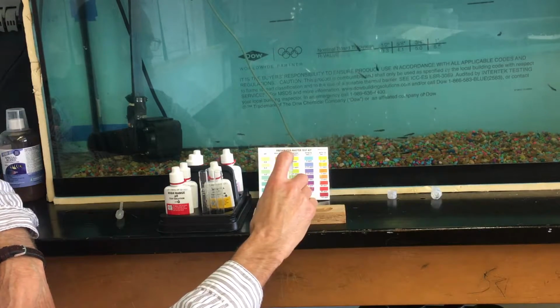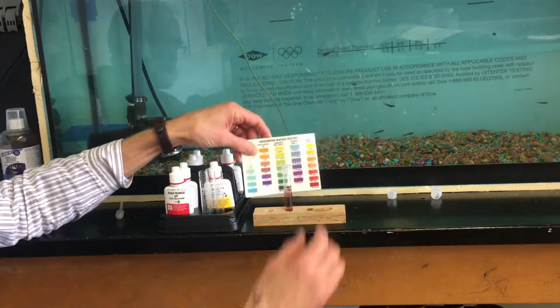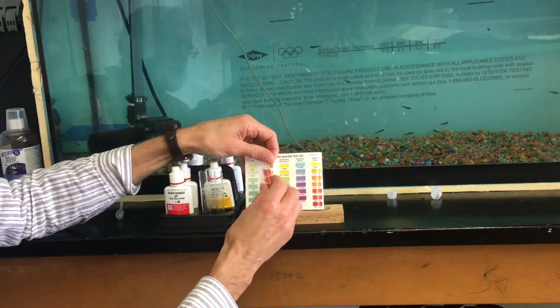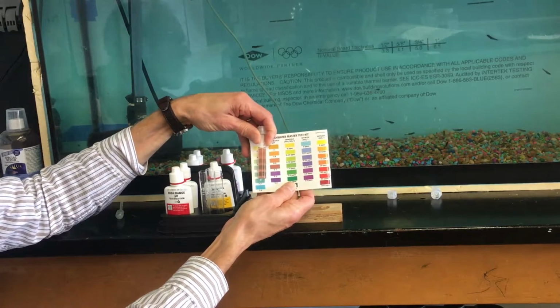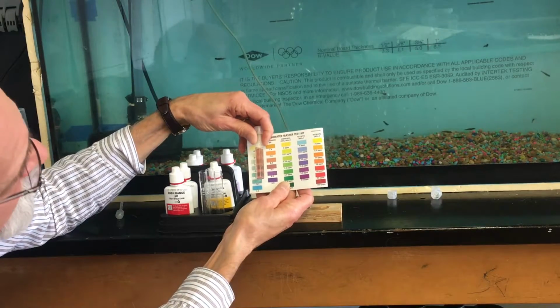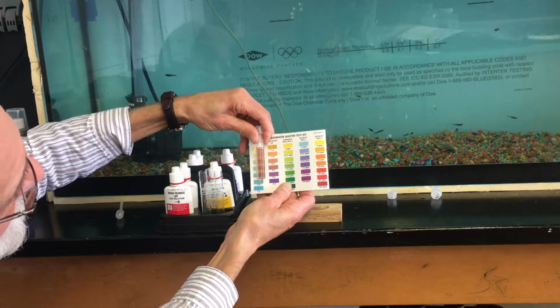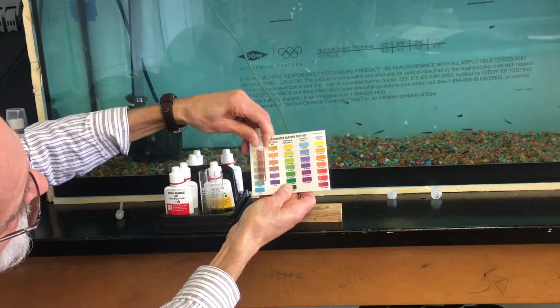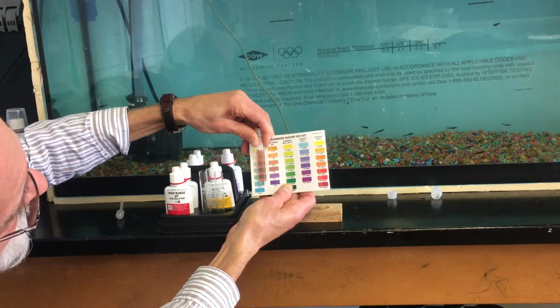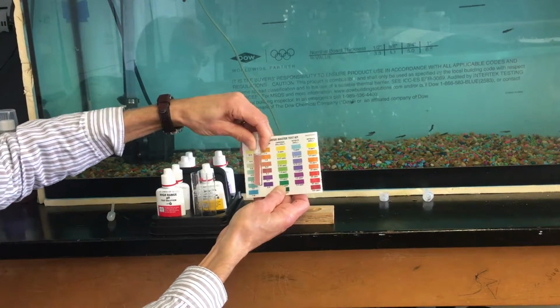And after I have agitated it, I can read the test and compare the color of the water in the test tube with the color on the color chart that comes with the test kit. And that's the high range right here in this line. I hold it against the white background, and I'm getting a reading there of about, looks to me like it's 8 to 8.2, somewhere in that range.